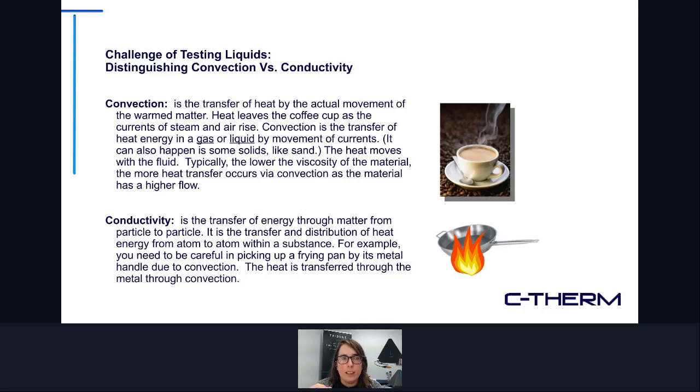Convection is a good thing for most thermal management applications. Gases and fluids transfer heat very well through their heat capacity when you're moving the fluid. So in most thermal management applications, things are designed to encourage efficient convection over surfaces that are either generating heat or which are basically acting as heat sinks to spread the heat away from the heat source.